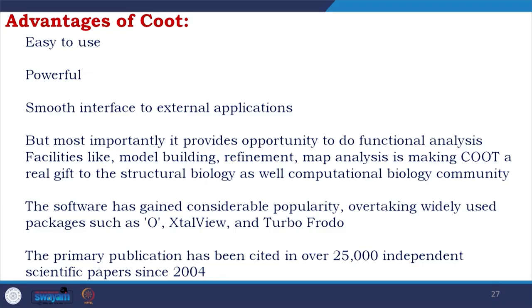So, I would conclude this session by saying the advantages of Coot: it is easy to use, it is powerful, it has a smooth interface to external applications, but most importantly it provides the opportunity to do functional analysis, with facilities like model building, refinement, map analysis, making Coot a real gift to the structural biology as well as the computational biology community.